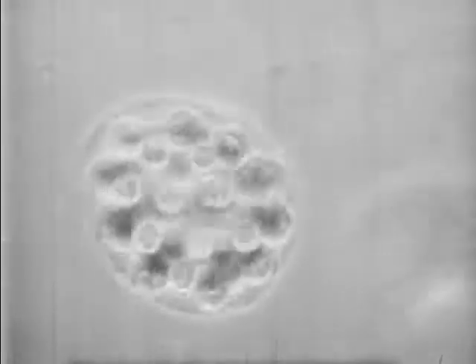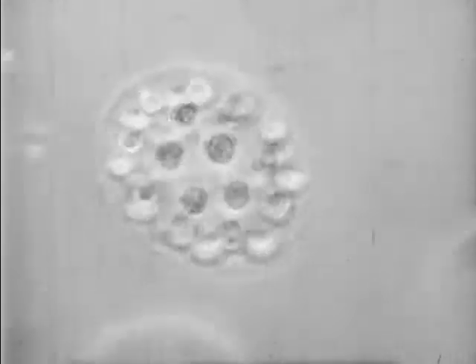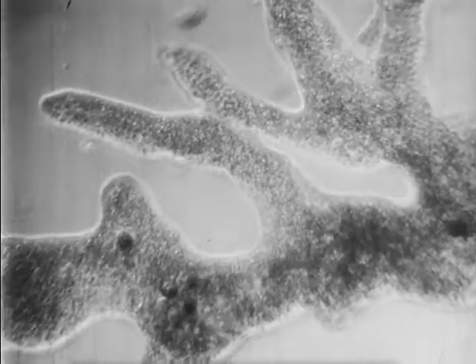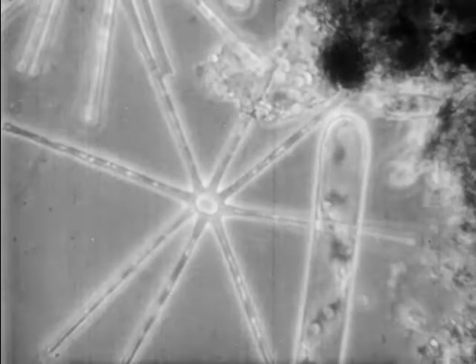There are so many shapes and colors and kinds of movements that the microscope has revealed to us. And there are so many of each kind.